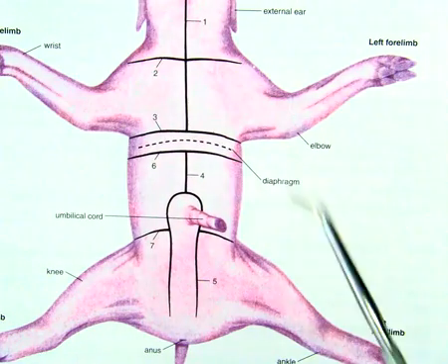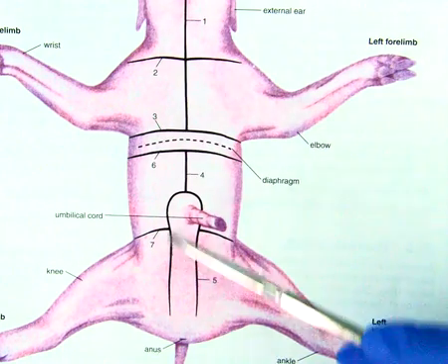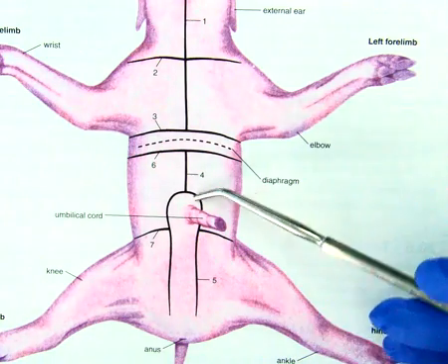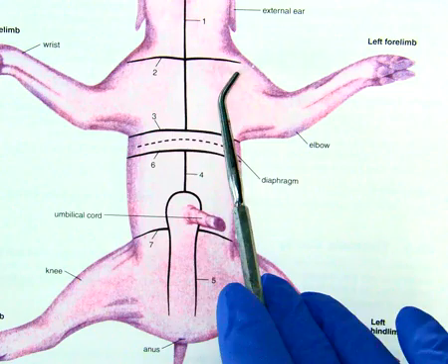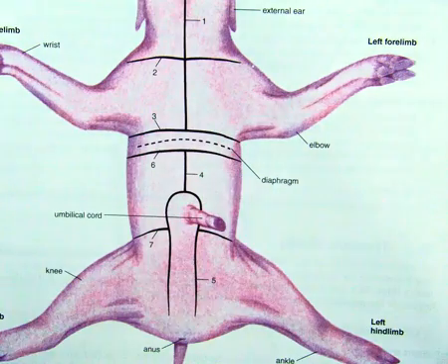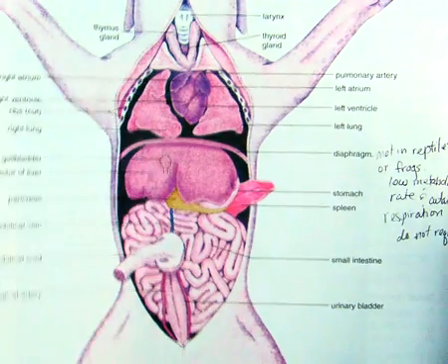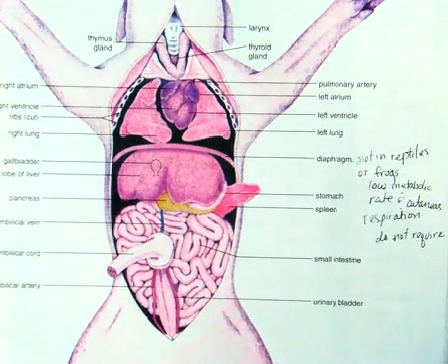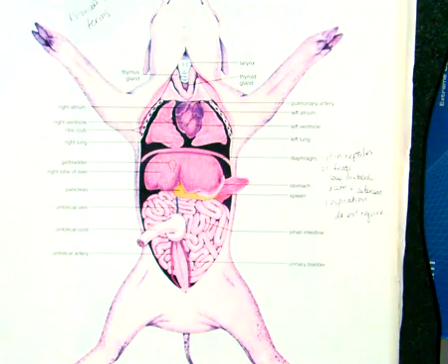There were a series of cuts. Really what you're looking for is a midline incision that excludes the umbilicus, because the bladder is going to be found in here and you want to conserve that. Then some horizontal cuts so that you can open up the body cavity and take a look inside. When we've looked inside, as Dr. Kett pointed out, they really didn't follow their dissection. They just have a gaping hole here.